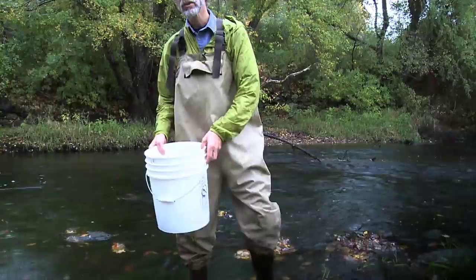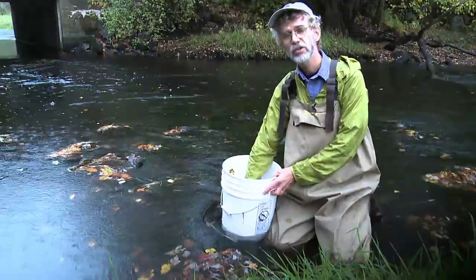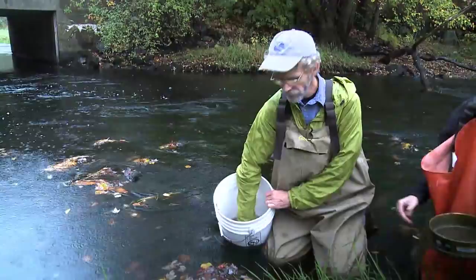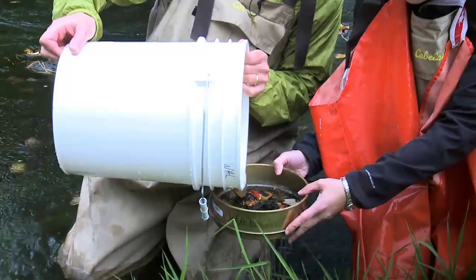We like to wash the sample so we can get any stones or gravel separated from the insects and leaves, and we swirl it to dislodge the insects that are in the debris collected off the bottom. We'll pour that through a number 30 mesh screen to trap the finest insects but allow the water to go through. Then we'll pour it through the number 30 mesh fast enough to get the debris out but slow enough to get the rocks and the sand in the bottom of the bucket.